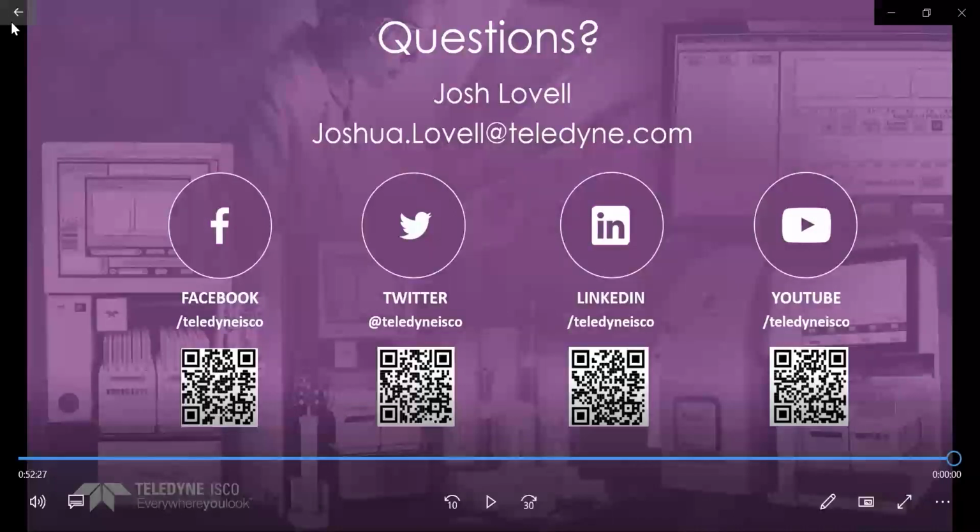Another really good question here is, could you use the amine column in a HILIC fashion? And you definitely could. You can use any stationary phase in a HILIC mode. The idea there is that you're going from organic solvent to increased water content. So it's opposite of the reverse phase. So it's really just an extended mobile or normal phase separation. So that's something you could do.